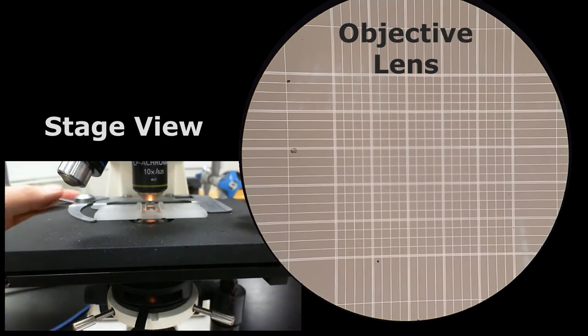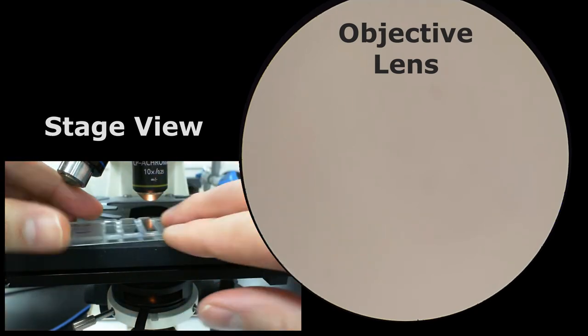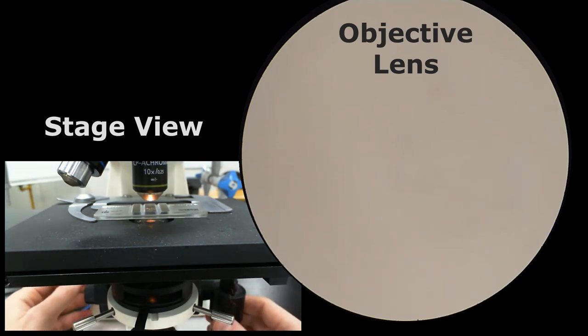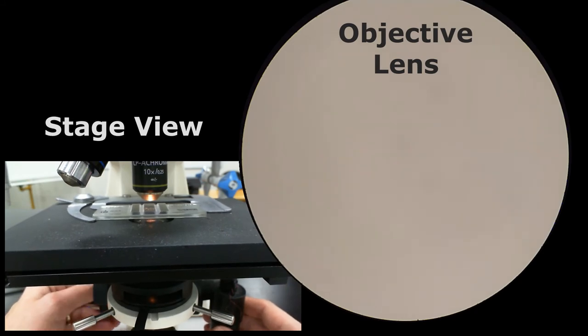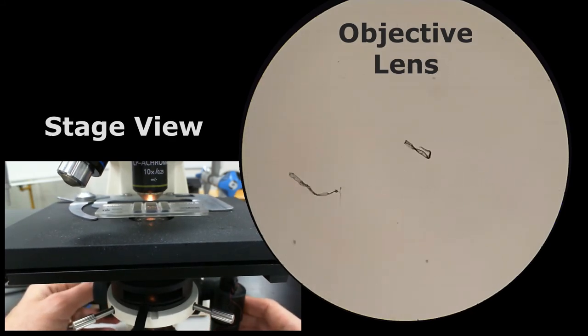Okay, now let me put in the other chamber just so you can see the difference between them. Here's the other one now. Again, you need to get into focus. So I'm going to just move this slide back and forth, and I can see something here. I'm going to bring it into focus. And do we see any lines here? Well, if you have good eyes, then yes.